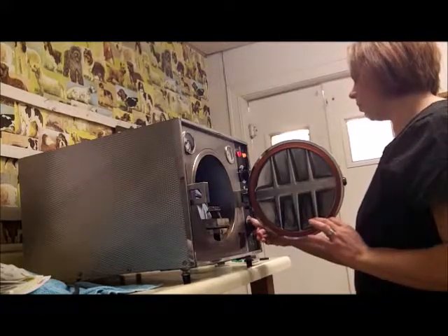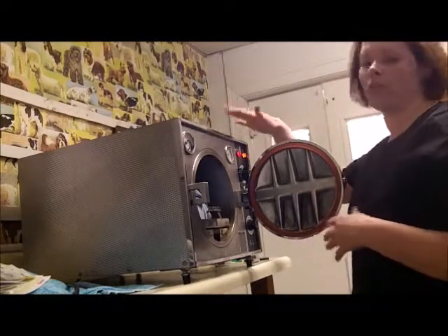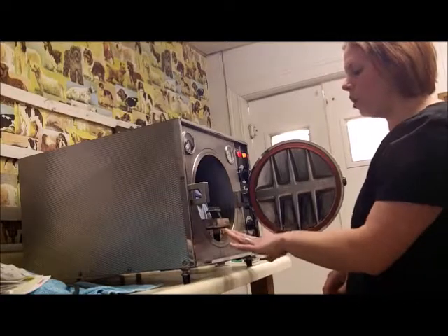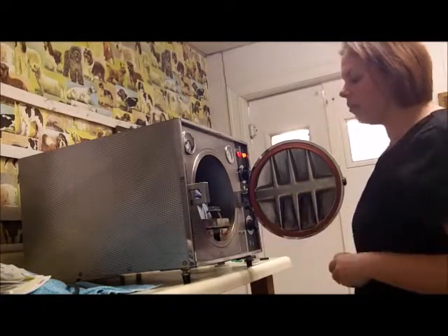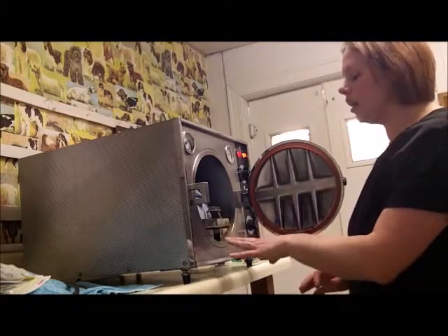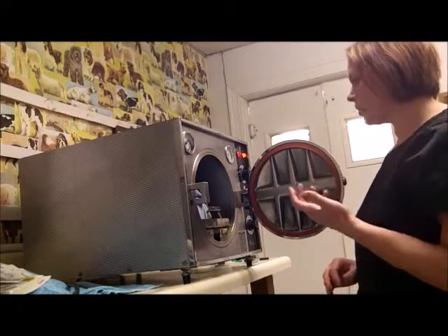We're going to start to fill it with the distilled water. I've already ensured that there's plenty of distilled water in this machine. So the water will fill the bottom of the tray. There's a little indicator plate here that we will watch. Once the distilled water has covered the plate, then we will close the door and set it to sterilize.